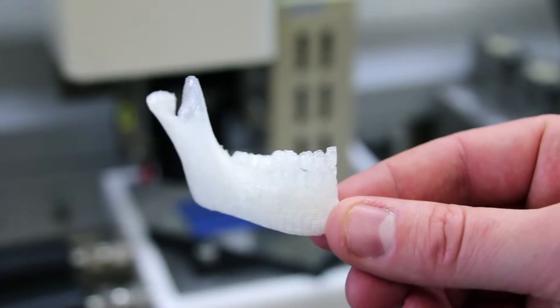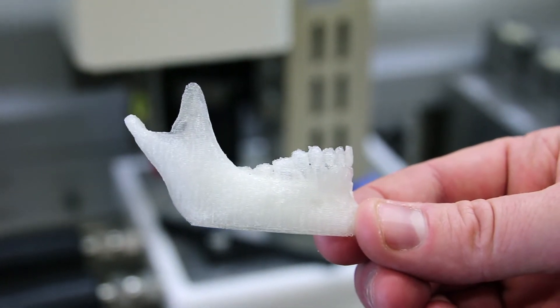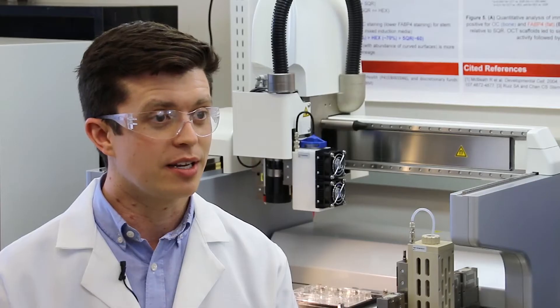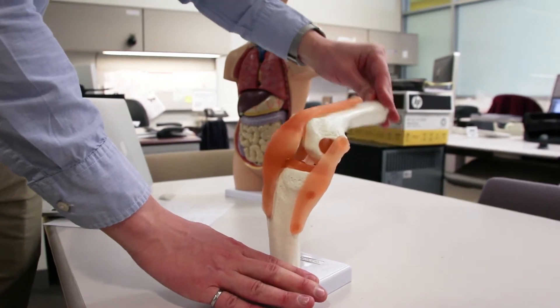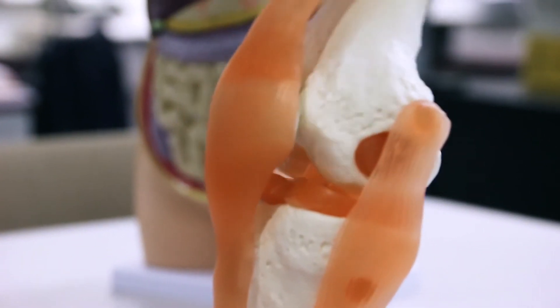With the precision of the EnvisionTech bioplotter, we can actually reproducibly print composite structures. We're looking at generating healthy cartilage and healthy bone in both young patients and aged adults.